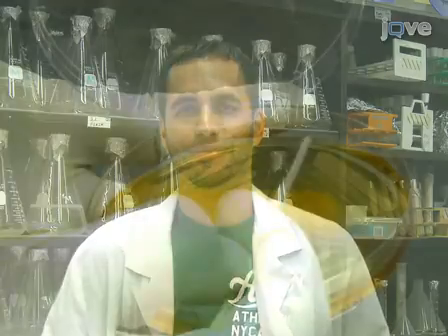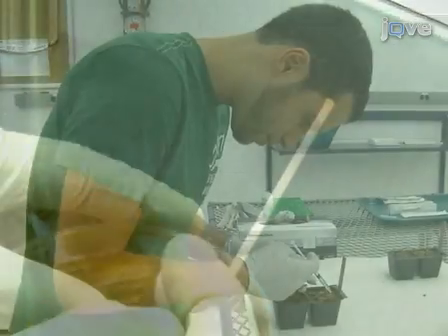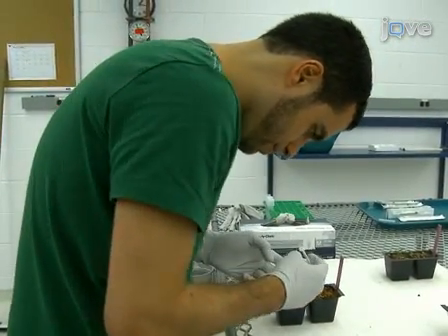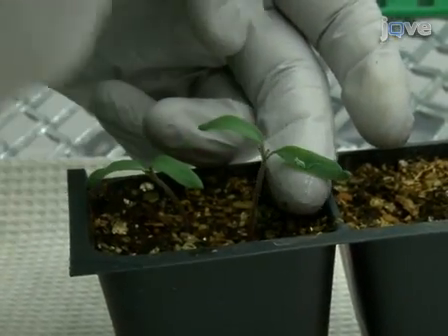I'm Andre Velazquez from the Laboratory of Grape-Martin at the Department of Plant Pathology and Plant Microbiology at Cornell University. Today, we will show you how to do virus-induced gene silencing in tomato and Nicotiana benthamiana. We use this procedure in our lab to study the interactions between our plant pathogen and its host. So, let's get started.